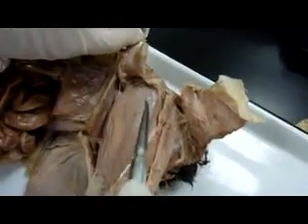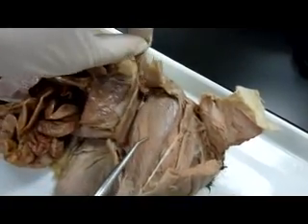Semitendinosus — that's right. And the big one here is our vastus lateralis.